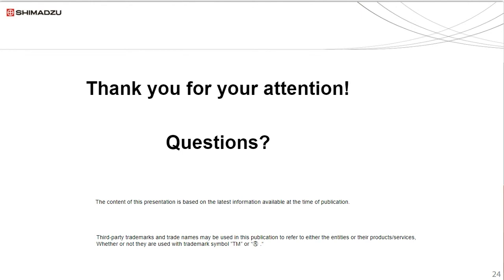That's a great question. So we have copper cones, we have nickel cones. I prefer the nickel cones because they last a little bit longer and they don't contribute a lot of background to nickel sensitivity in the analysis, so it's fine even for PPT level nickel analysis. But if you're really trying to get very, very low levels of detection limit for nickel, the copper can be fine. They just have to be replaced a little bit more often. They're more sensitive to acids, and so the orifice dissolves a little bit more than nickel.